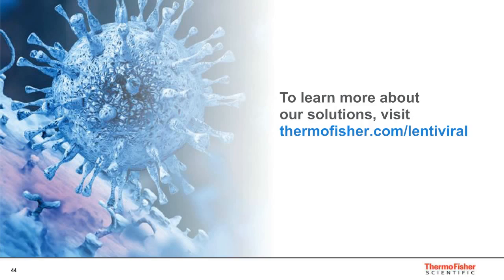Okay, Xavier, another for you. Have you done any experiments using LV Max to generate CAR containing LV instead of GFP?